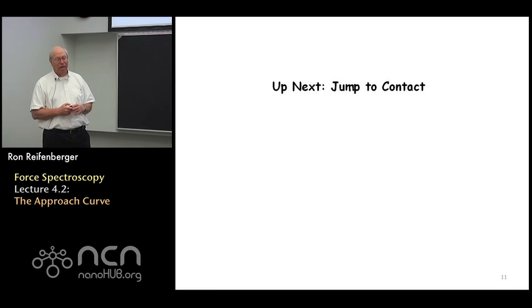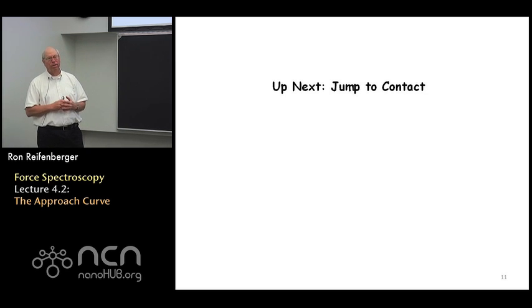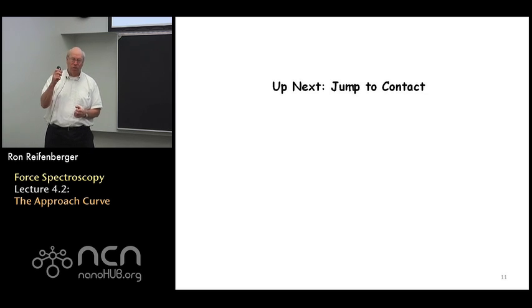What we're going to talk about next is we're going to focus on this jump to contact feature and try to understand it a little bit better, and then we're going to come back and go after this force versus displacement curve in more detail and show you how to take your experimental data and extract useful information. So we'll see you for the next lecture.